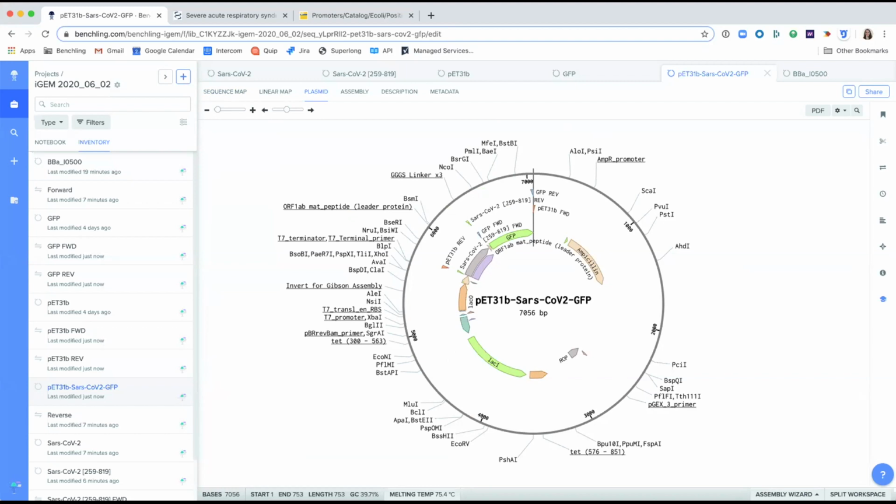Now that we have created our construct in Benchling, it is best practice once you create a construct to sequence verify it so that you're sure what you have created matches what was expected. A great way to do that in Benchling is to utilize our alignments tool. I've already created some sequencing files for us to use to create an alignment, but from here is where you would send out your construct for sequencing and then receive those back from wherever you were sending your construct for sequencing.